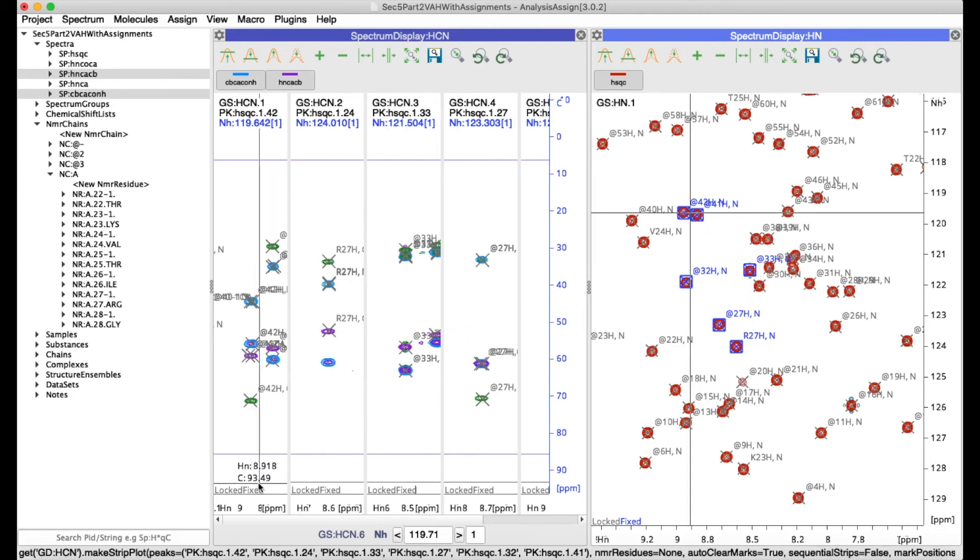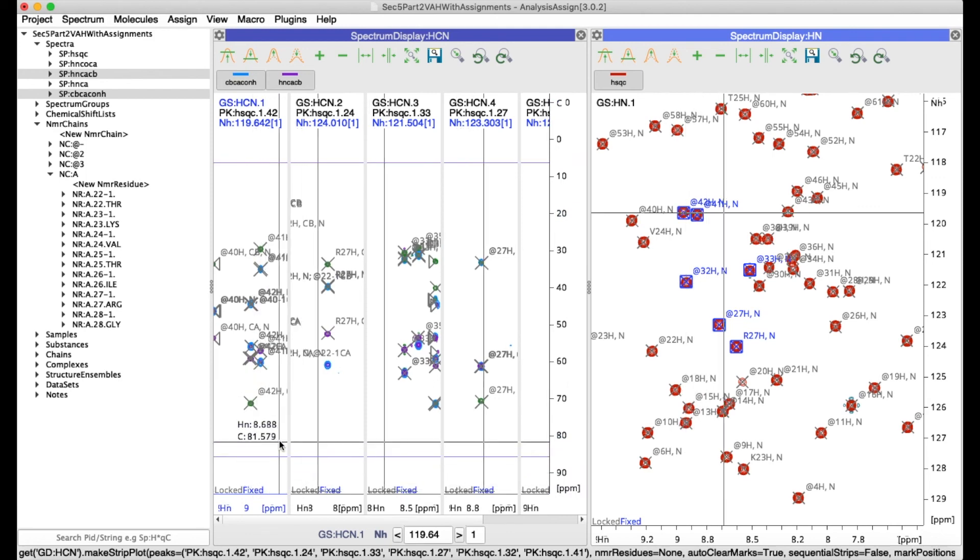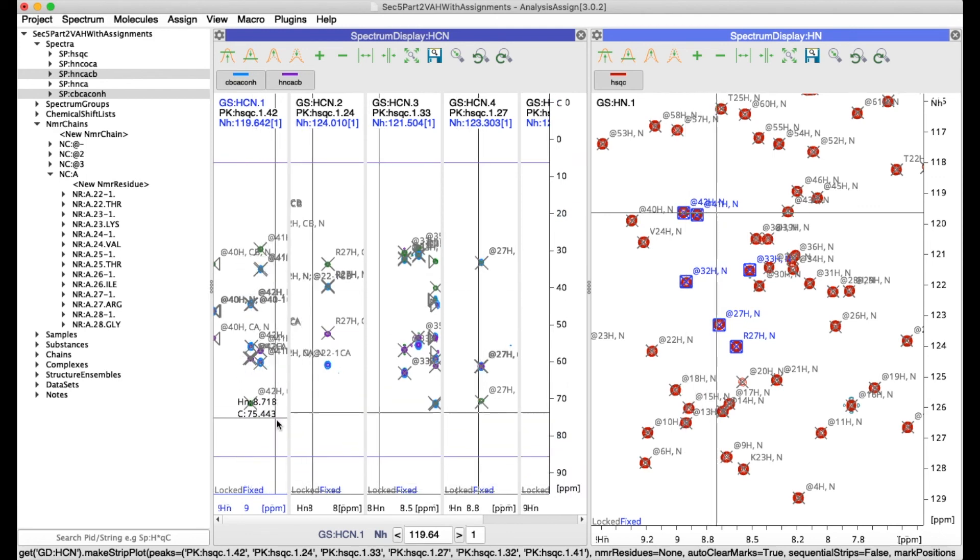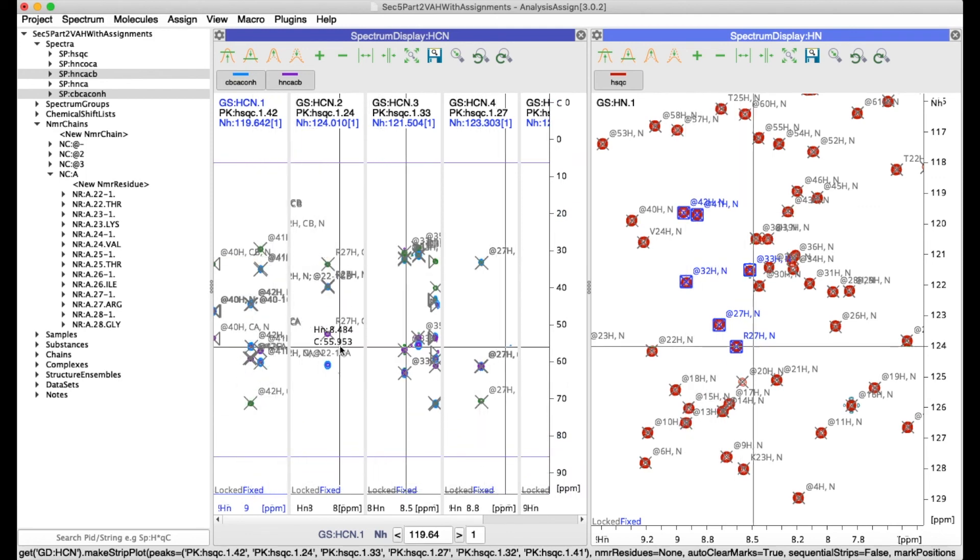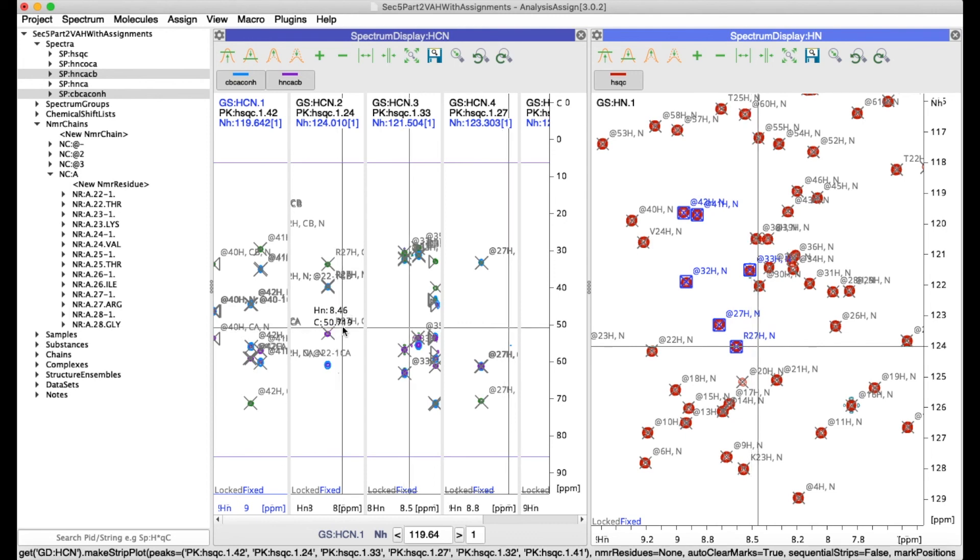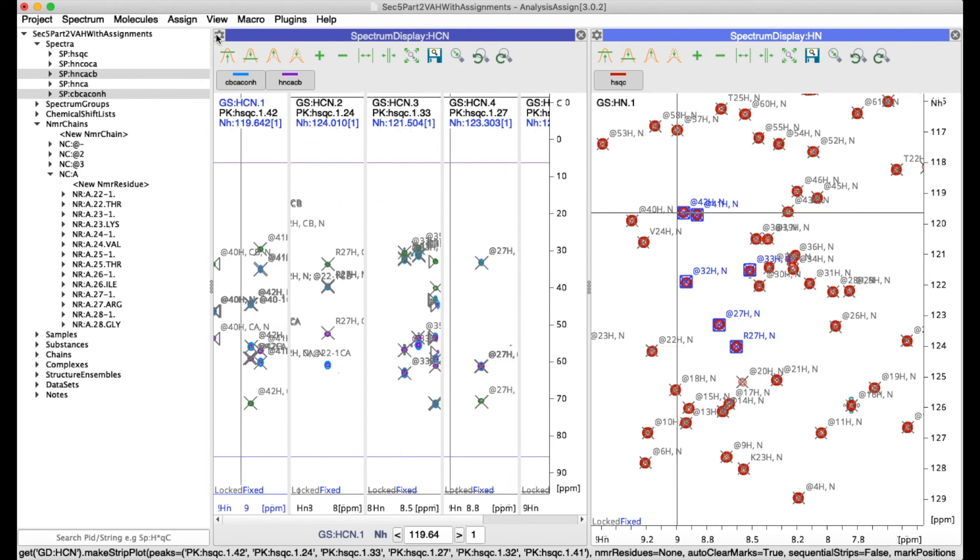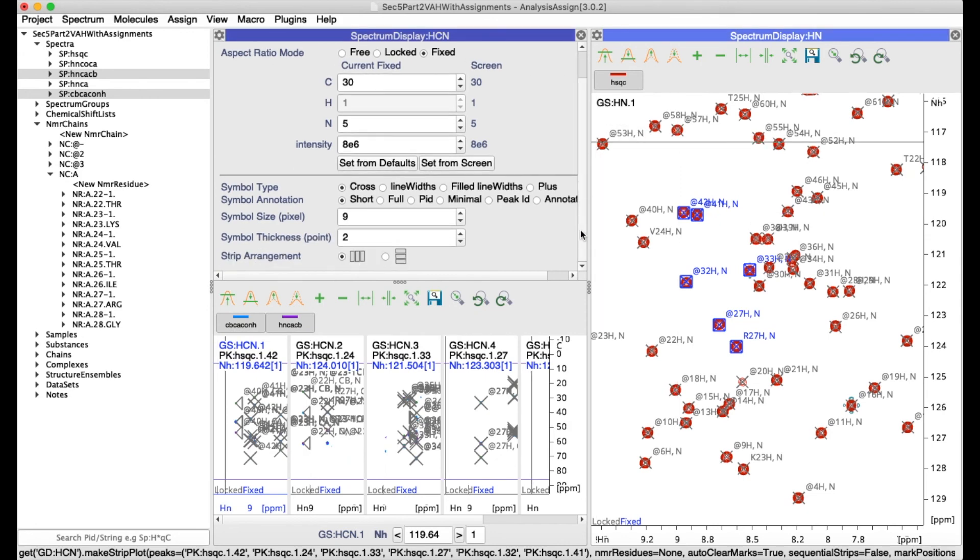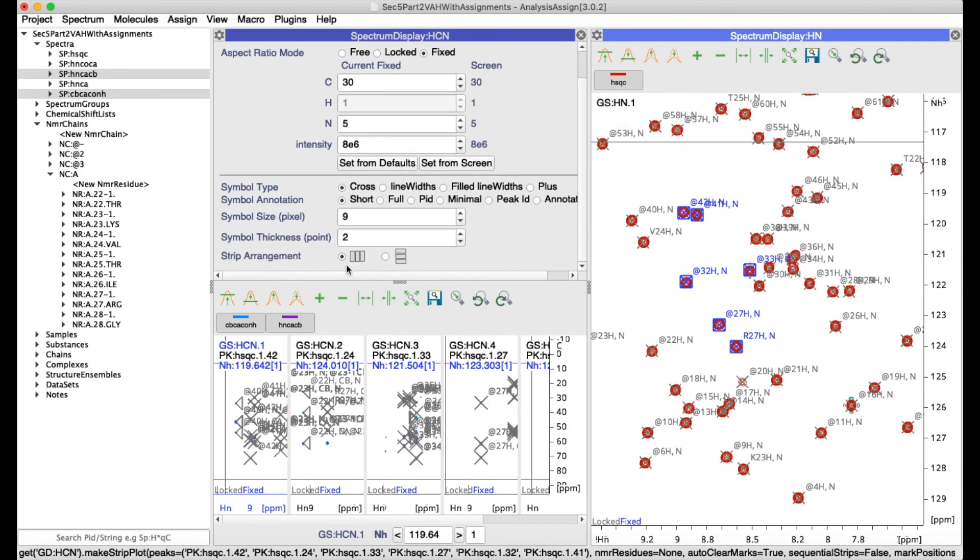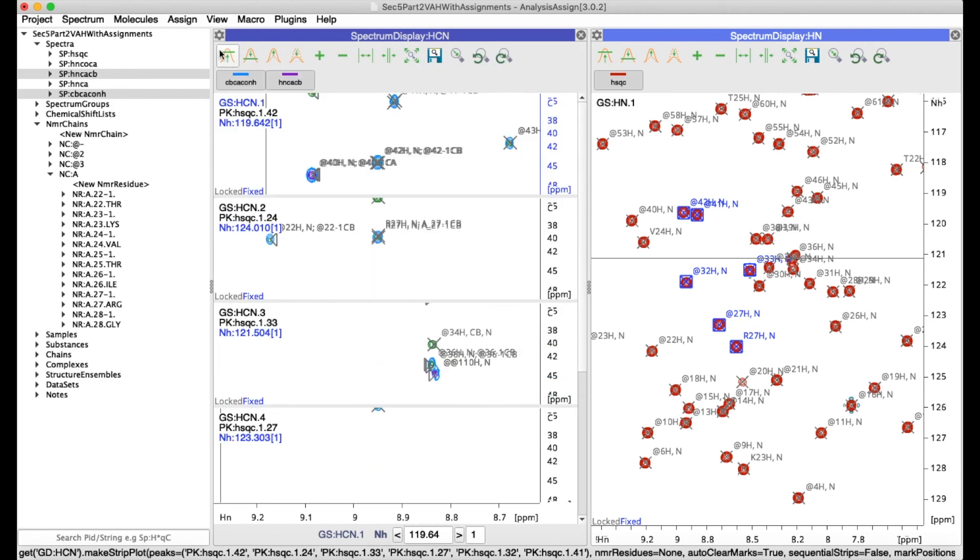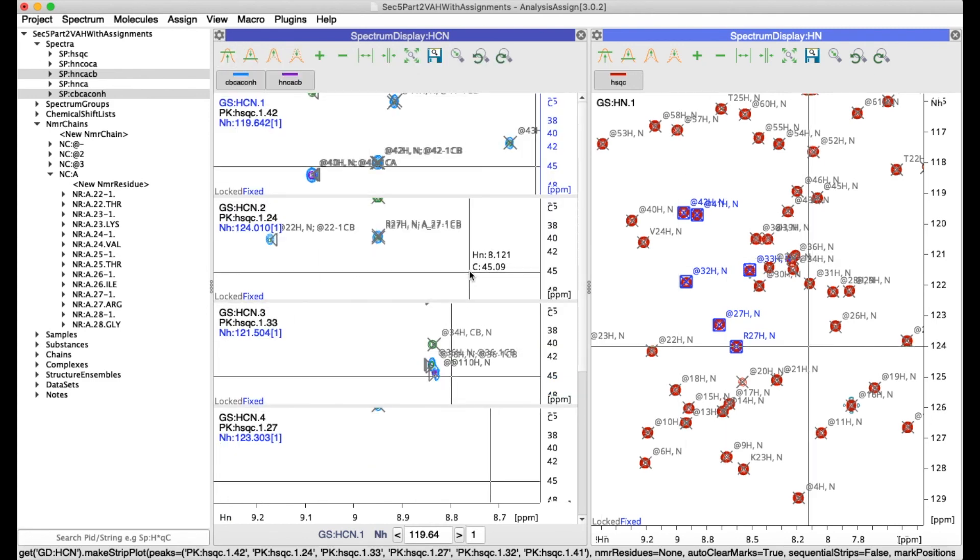Now by default the strips are always shown as vertical strips but you can also set them to be horizontal if you like. Simply go to the gearbox to open settings and then at the bottom you can select your strip arrangement and now you can use horizontal strips.